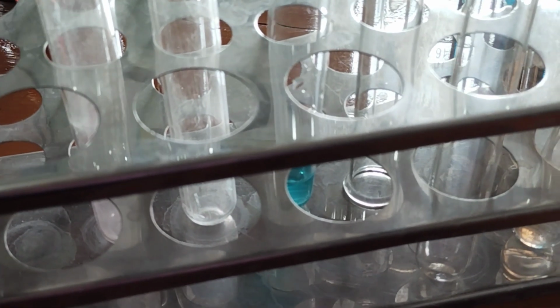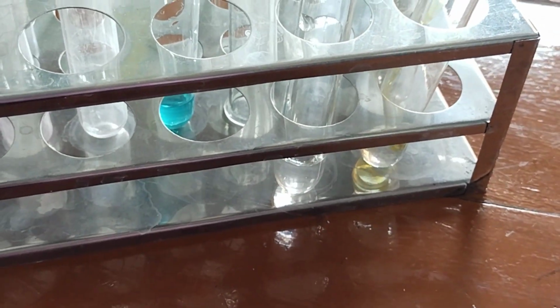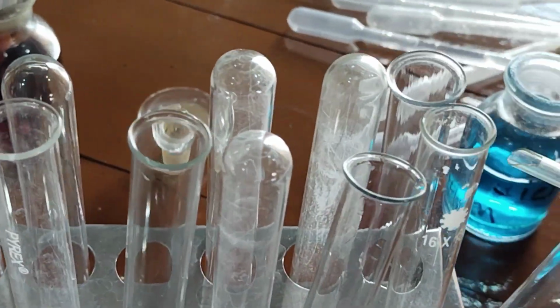After 5 minutes I am taking this solution in two test tubes, and in one test tube I will add iodine solution and see the result. So no color change using iodine solution, and in another test tube I will add benedict solution.